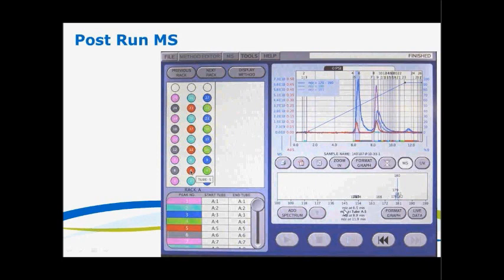And you'll see down below here, there's M over Z at 6.5 minutes, M over Z at tube A5, M over Z at 8.9 minutes, and M over Z at 11.9. These are 4 spectra that are available, and they will print out as part of the PDF when I save the PDF file.